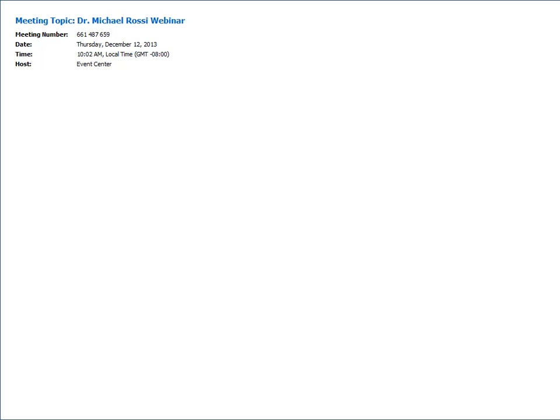Can you tell us what fold coverage you used? Mike, I'm not sure if you remember. I think it was 50 to 55, somewhere in there. Do you remember? Yeah, I think that's about it. So is that a question at the RNA-seq level, or is it at the BioNano level? It didn't clarify. Go ahead and answer the RNA-seq side.